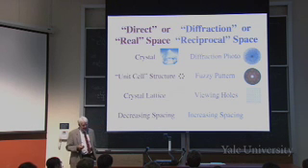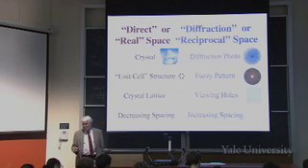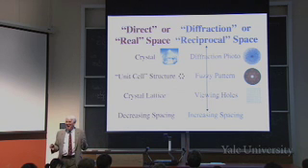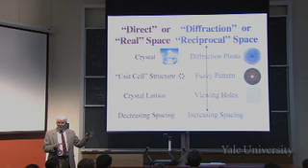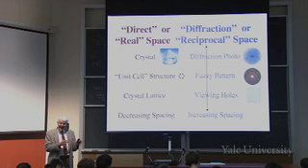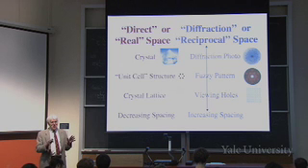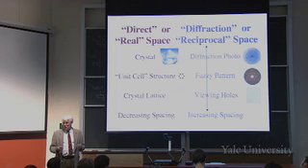And remember that decreased spacing in real space corresponds to increased spacing in reciprocal space, which is, of course, why it's called reciprocal. So that's what we want to understand about how it works. There are patterns which give rise to patterns in reciprocal space, that fuzzy thing. And then if you have a repeating lattice of that, it gets concentrated into particular points, but it's the same underlying pattern. So there's the pattern, which is the structure of the molecule, and there's the lattice, which is the structure of the crystal.